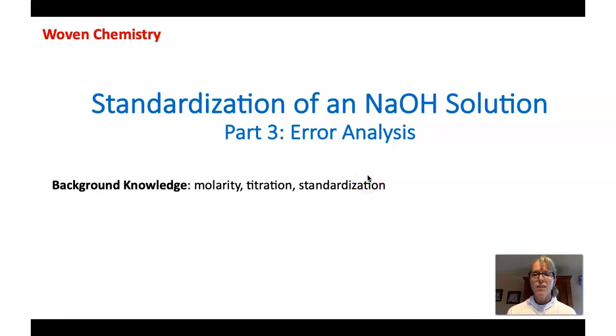I'm Jean Weaver, and in this video we're going to focus on standardization of a sodium hydroxide solution. Specifically, we're going to focus on error analysis. This is definitely the higher level thinking, the thinking that will get you that 5 on an AP exam or maybe an A in a Gen Chem class.